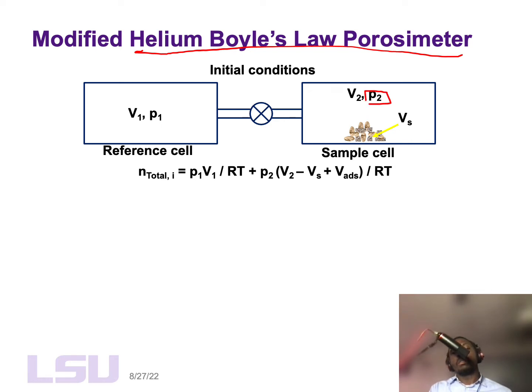So again, this is stage 2. Stage 1, you calculate porosity as usual, which involved calculating Vs using helium, right? And then from Vs you get porosity. But here you want to get the volume that has been adsorbed into the pore walls of these crushed sample.